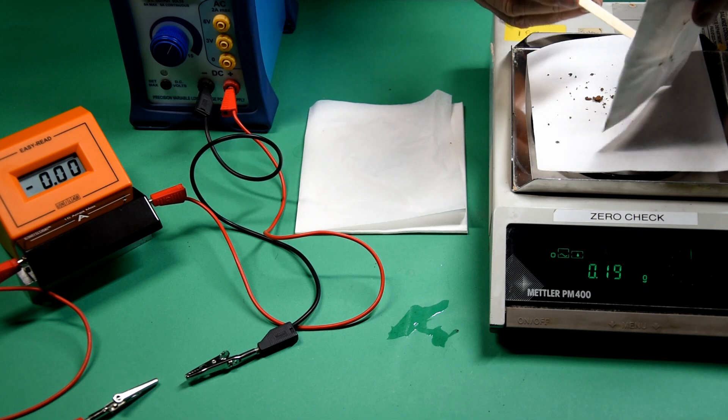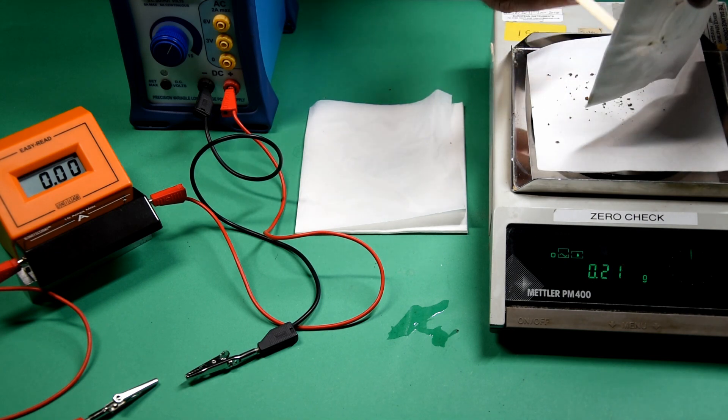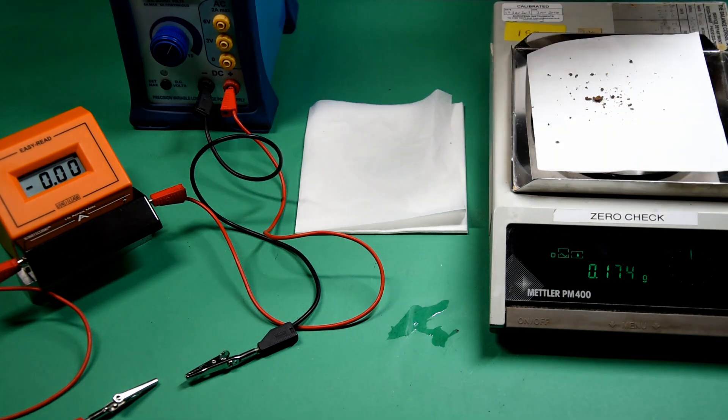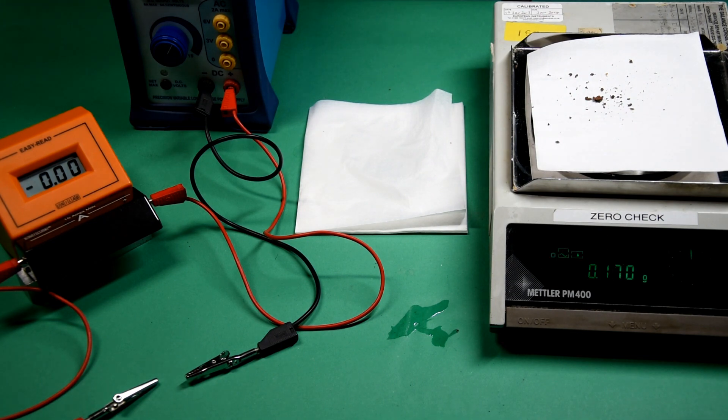Having left this to dry, we find that the mass of the sludge turns out to be about 0.17 of a gram.